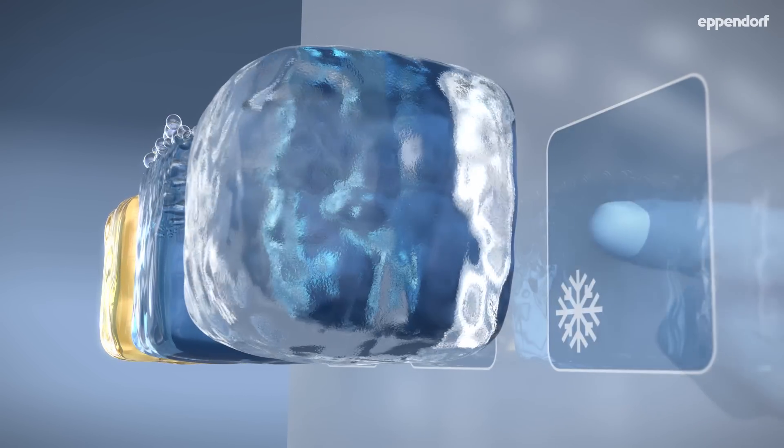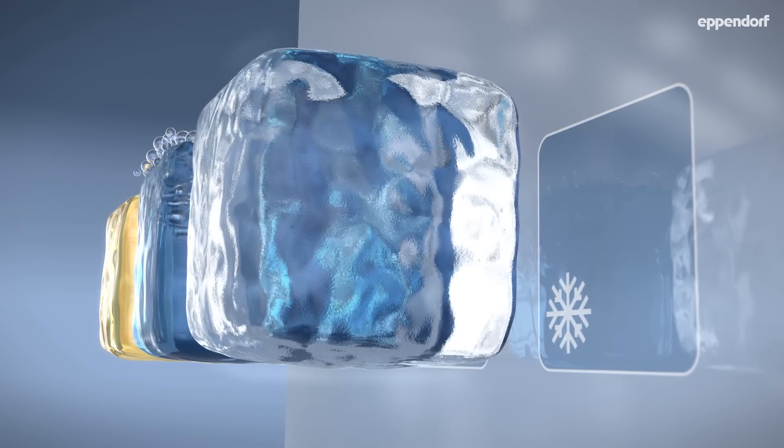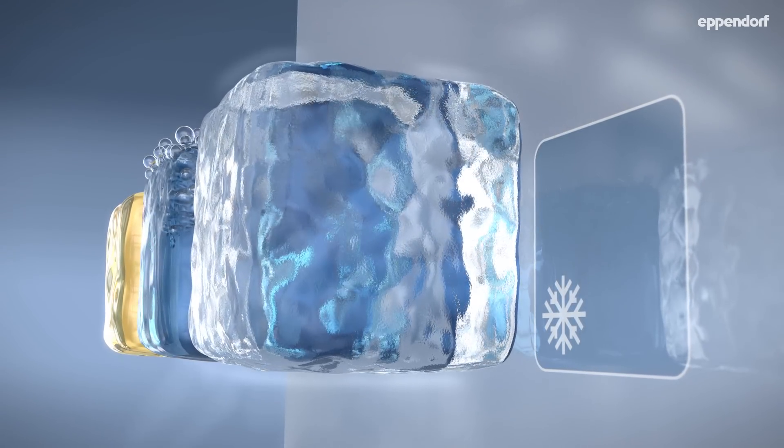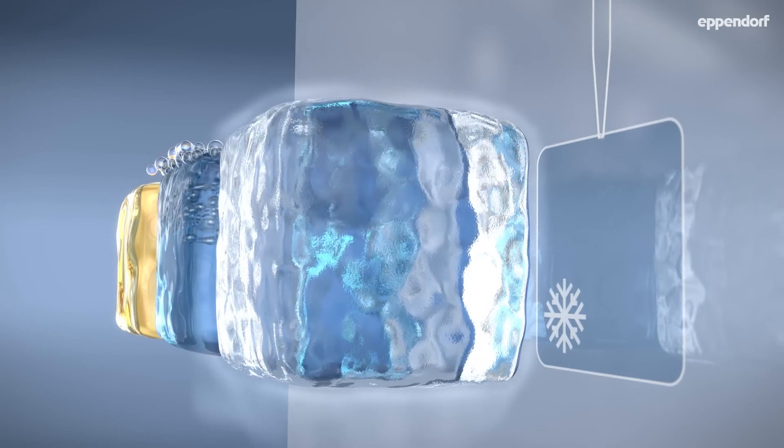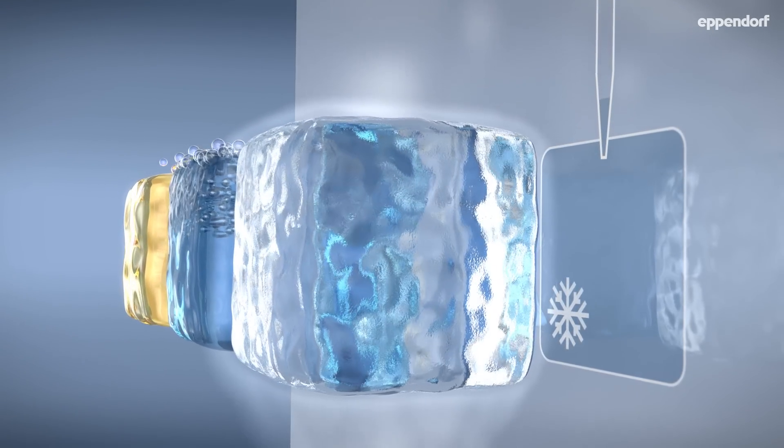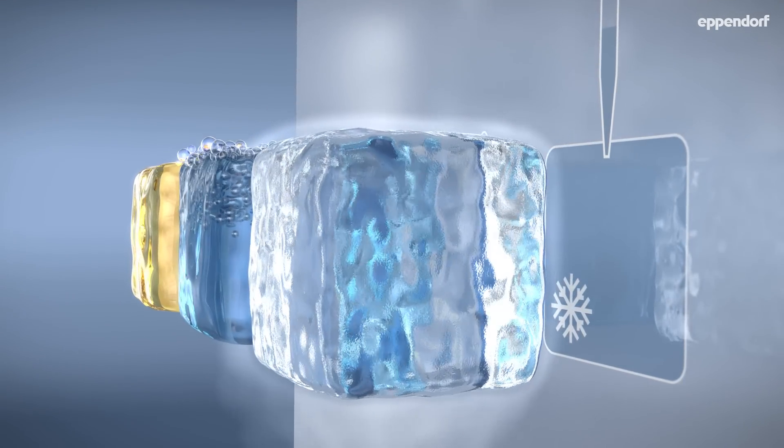Lastly, very cold liquids influence the air cushion in the pipette. If you pipette very cold or very hot liquids frequently, you should adjust your pipette accordingly. Again, the use of a positive displacement dispenser minimizes this problem.